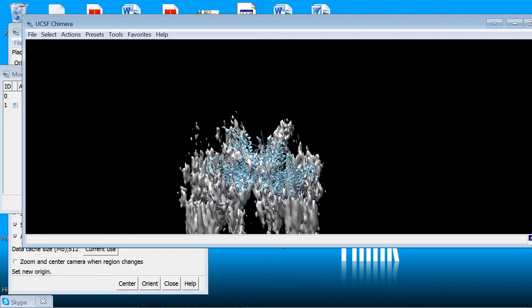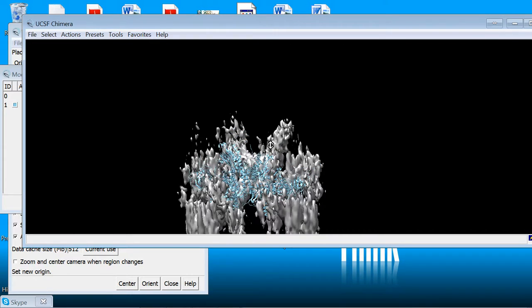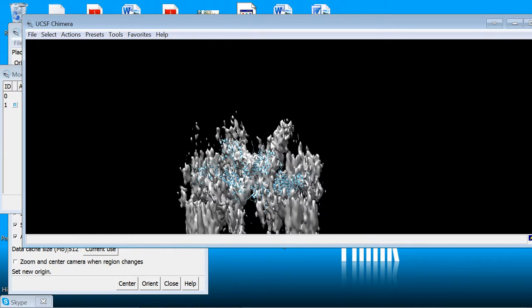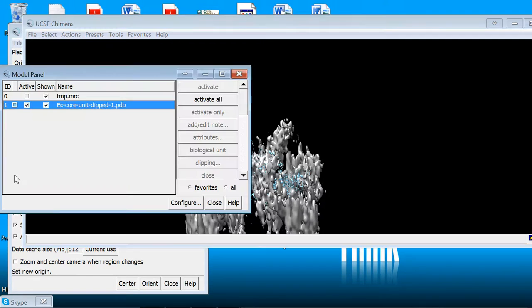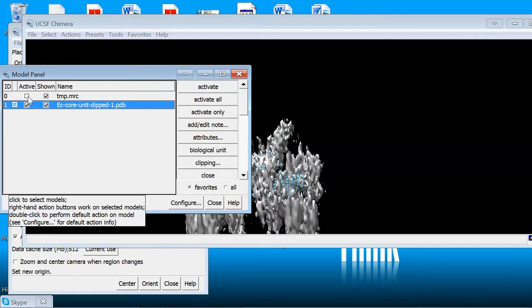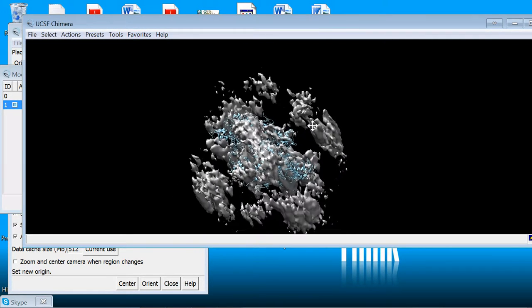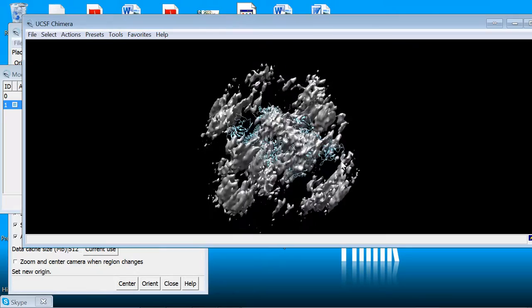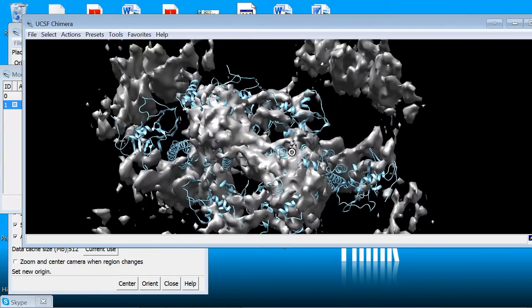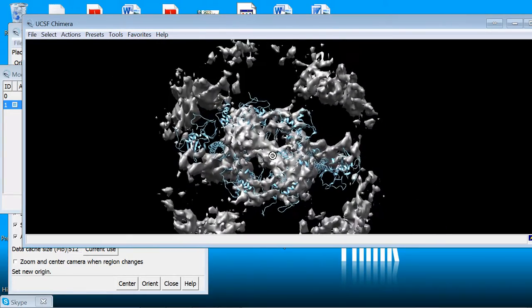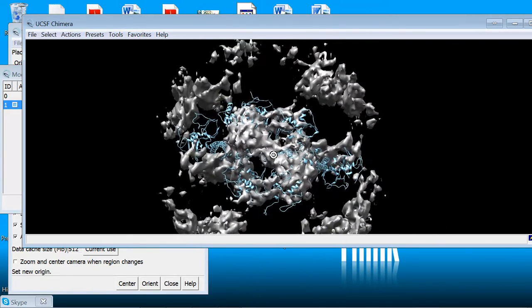Now I'm not going to go through all the shortcut keys and mouse buttons. I'm sure you can look that up. But once you get it about right, put everything back to active or hit active all. And even though it does a good global search, you want to make sure things are at least close.